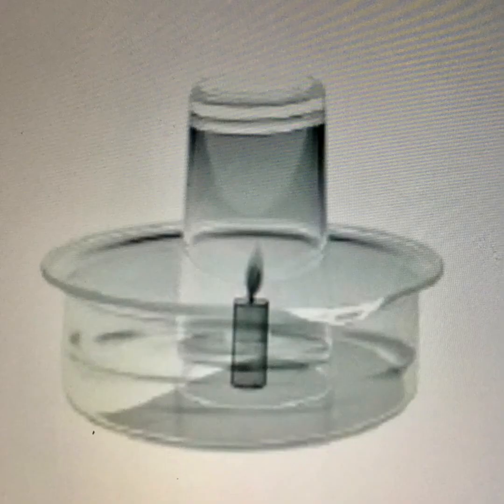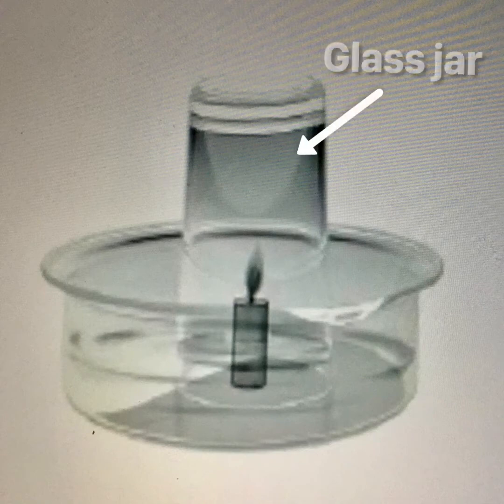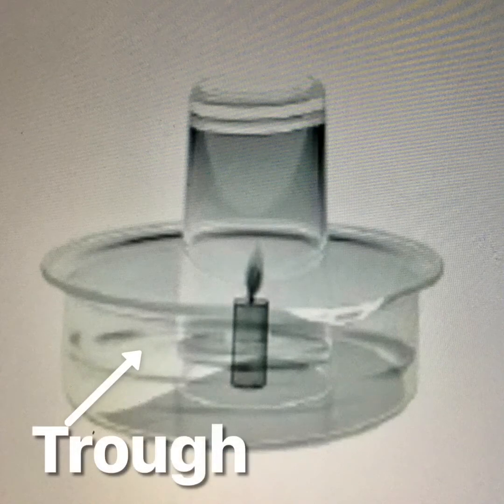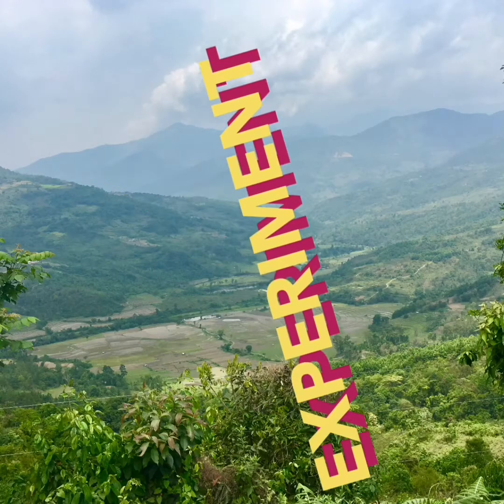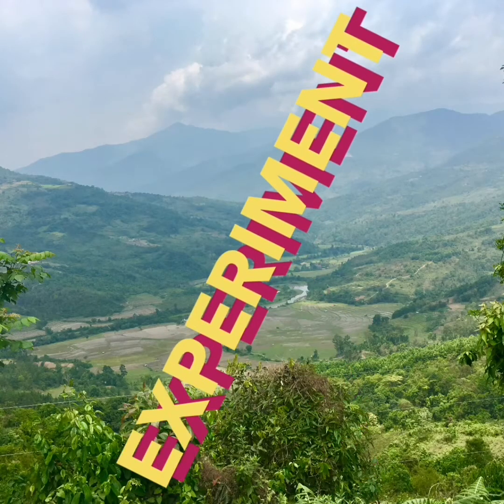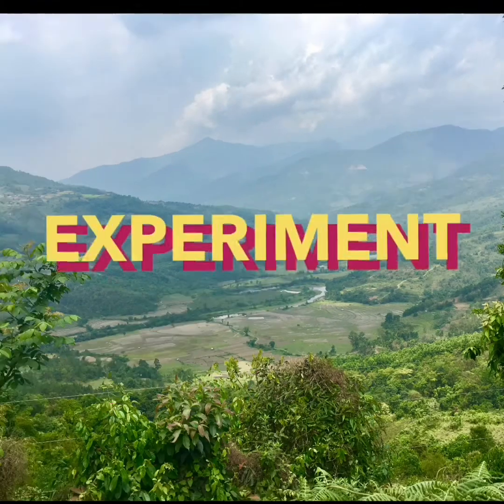We can check it out by using this apparatus: a glass jar, a glass trough, and a candle. We can prove it by doing an experiment. Before that, we'll try to understand the principle.